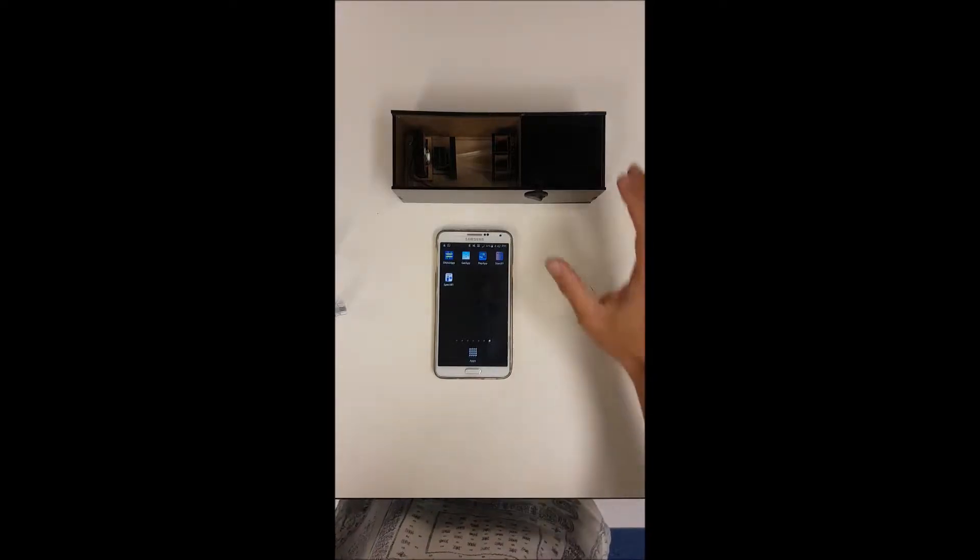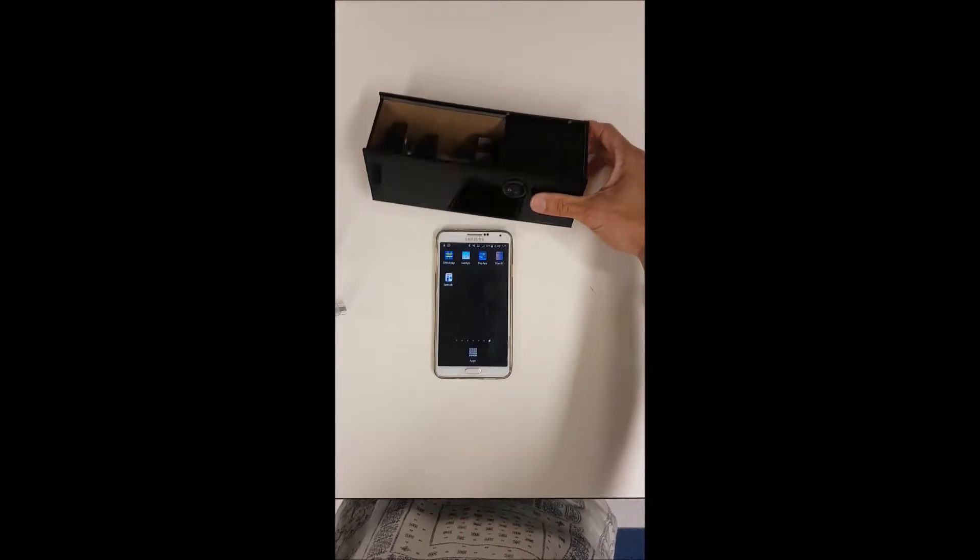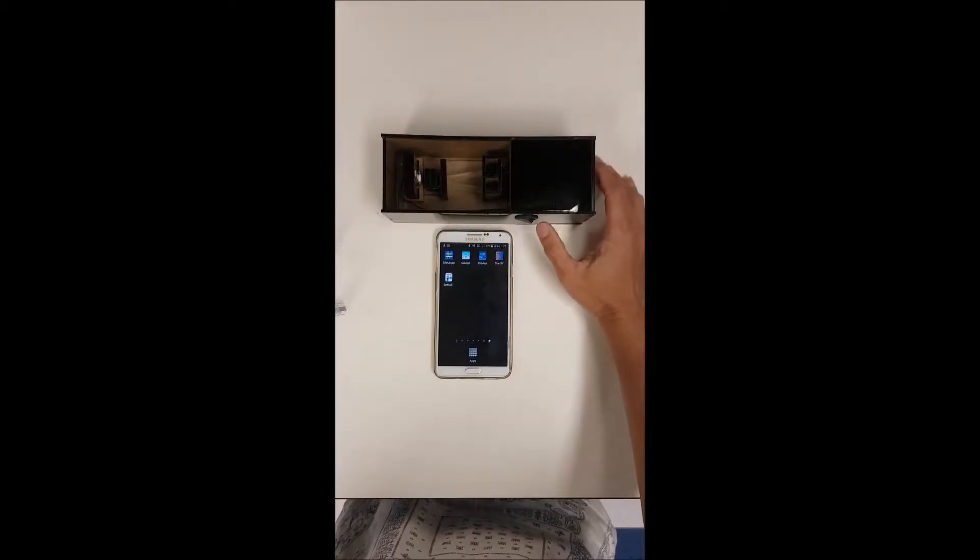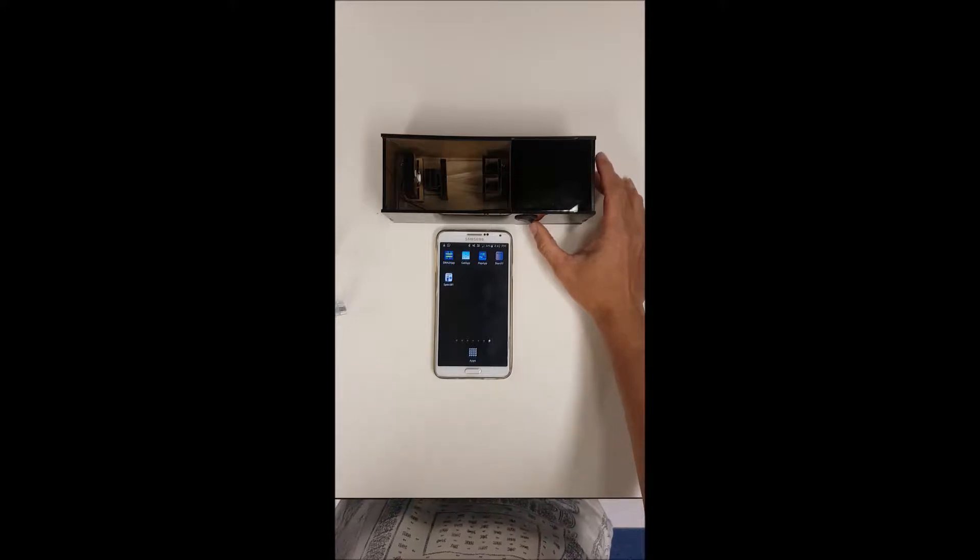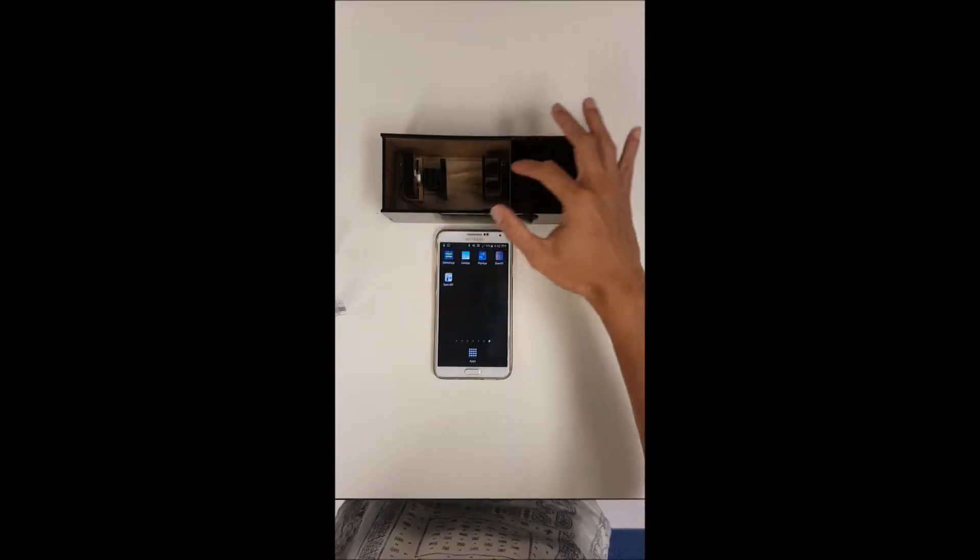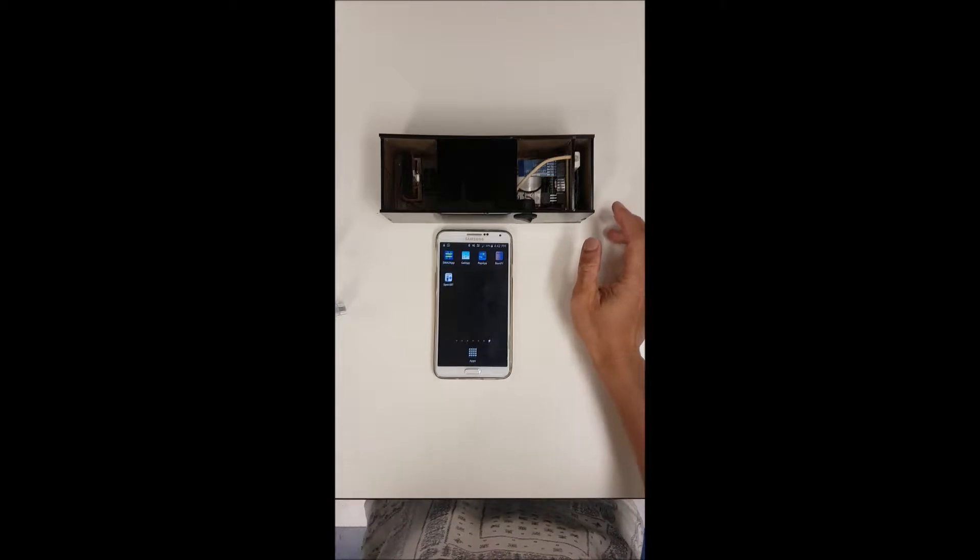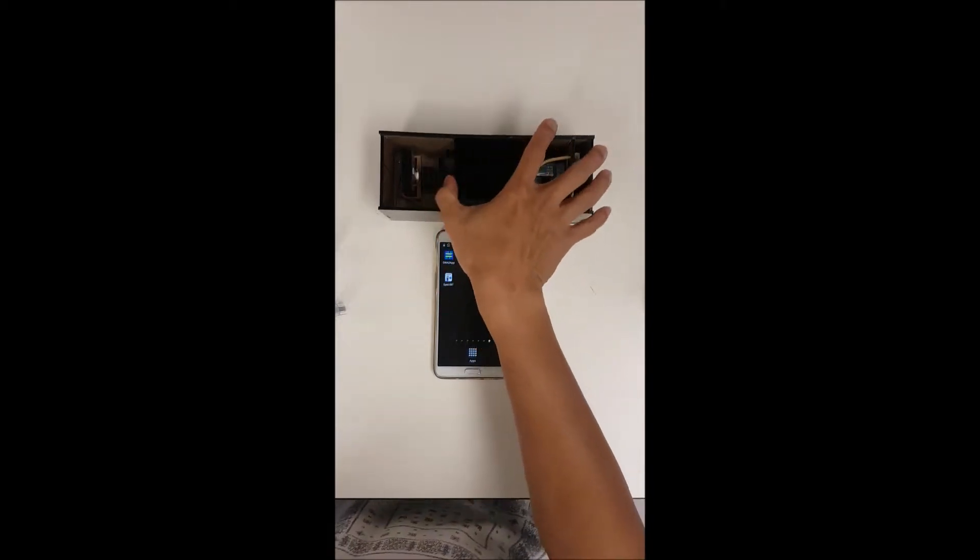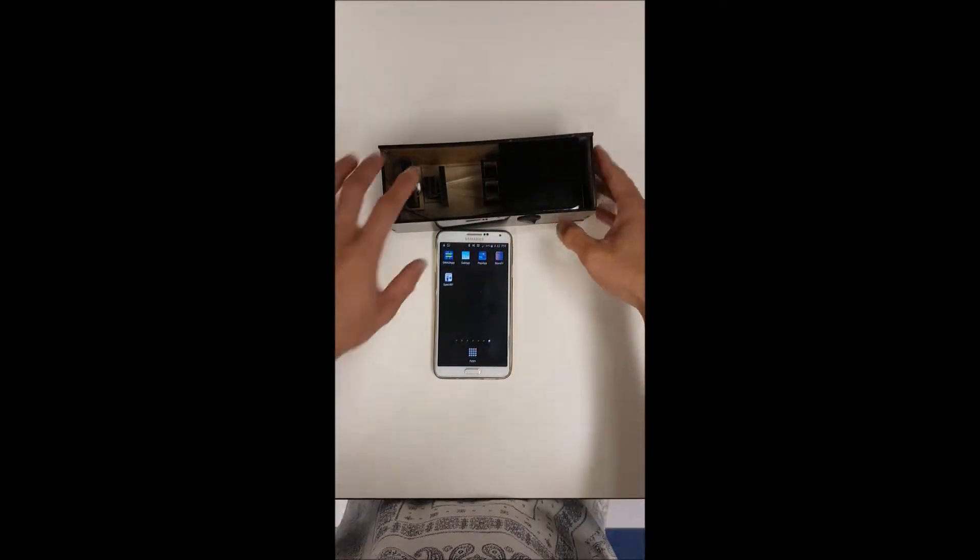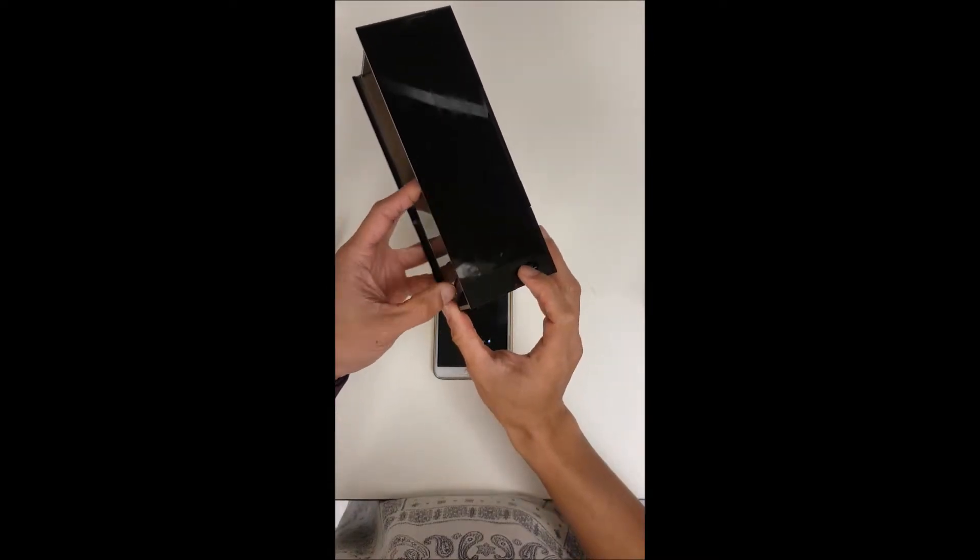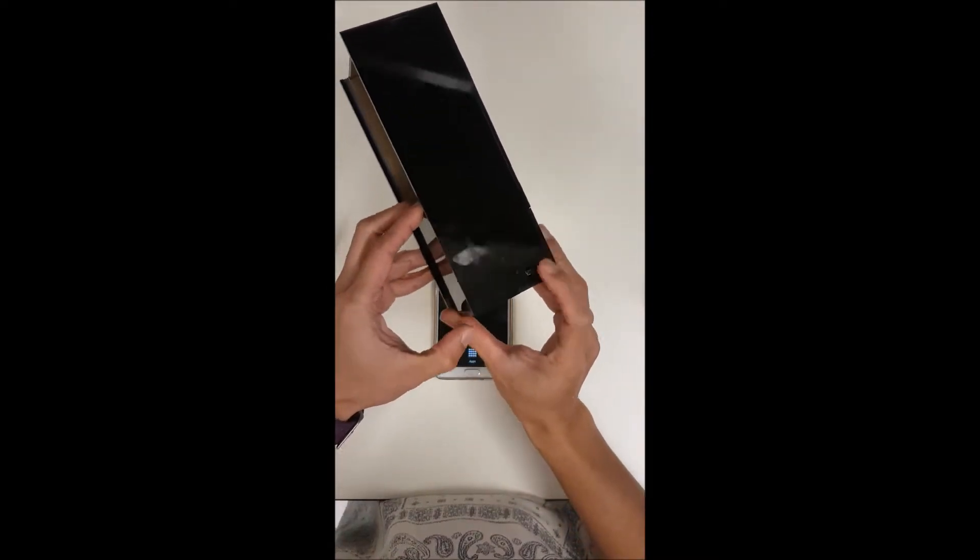We're going to show you the spectrophotometer component where there's an on-off switch and it has two channels for the cuvettes to go in and there's a light channel. Here we have the Arduino and the battery. It's a rechargeable battery so feel free to charge it using the micro USB port here.